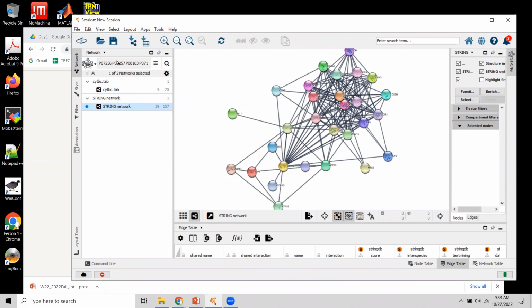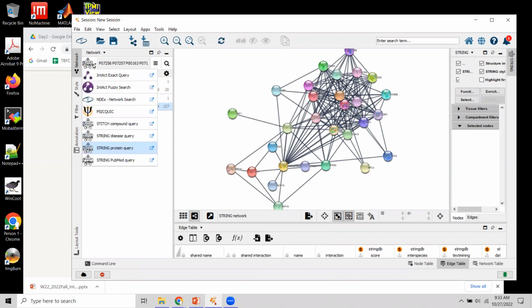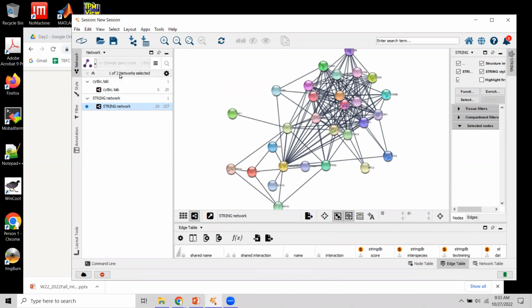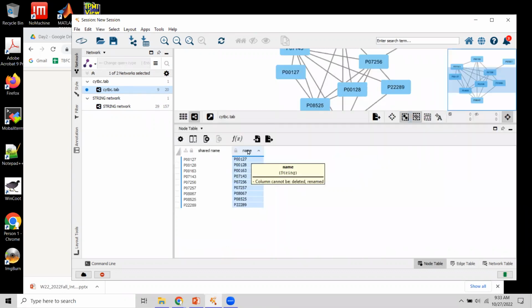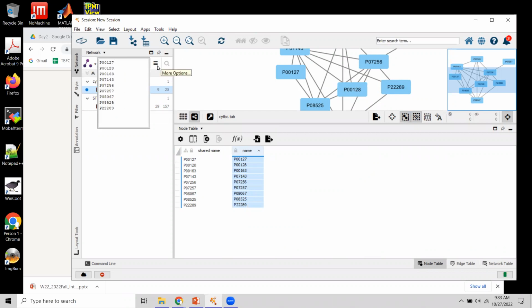Now, much more useful is the IntAct app. Okay, we can do the same thing as before. We can go to our initial network, go to nodes, then select all the values, and then we can Control V, paste the identifiers here.